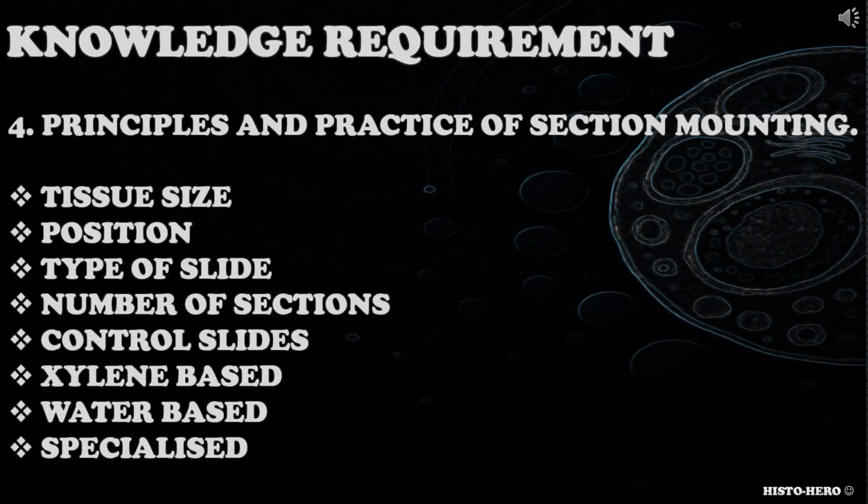When addressing this knowledge requirement, candidates should consider the way sections are mounted on the slide, tissue size, section position, types of slides available and when to use them, number of sections on the slide, use of control slides, different mounting media like xylene-based mounting for routine use such as Pertex, water-based mounting media for oil red O like Glycergel, specialized mounting media like anti-fade to prevent photobleaching and so on.